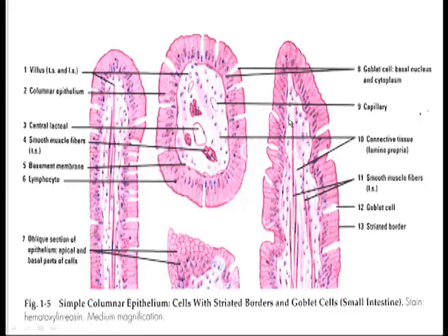We've got the connective tissue core in through here, epithelium on the surface, and this is where the epithelium absorptive cells are located. These are simple columnar cells, column shaped, with long nuclei, as we can see around through each one. Each of these intestinal villi has a series of intestinal absorptive cells, and intermittently they have goblet cells in there as well.